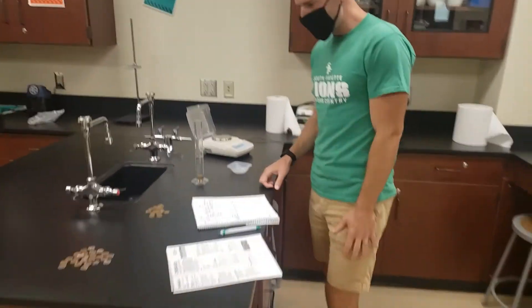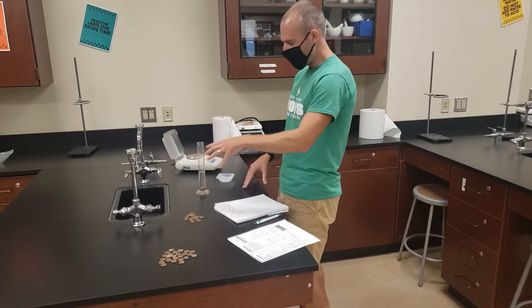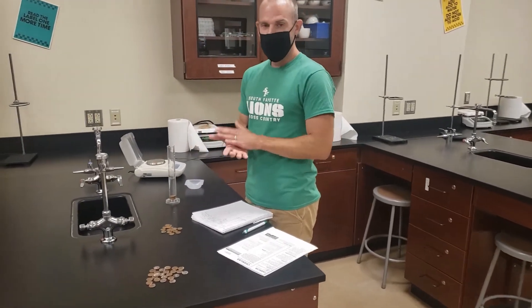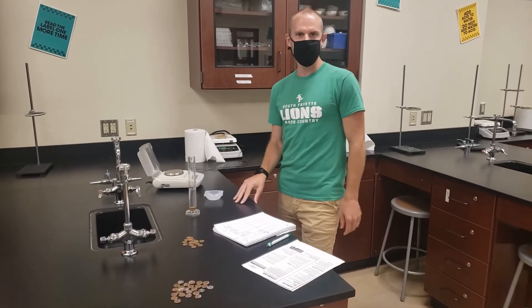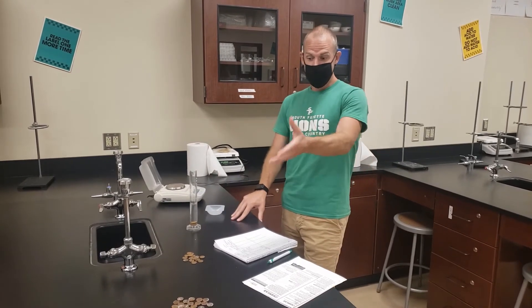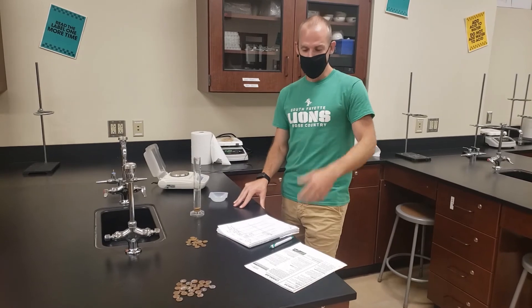I'm going to continue in this fashion until I've done that for all 25 of my pre-1982 pennies. At that point, dump the pennies out, dry them off really well, and get a new 50 milliliters of water or so in my graduated cylinder and perform the same data collection for the post-1982 pennies.